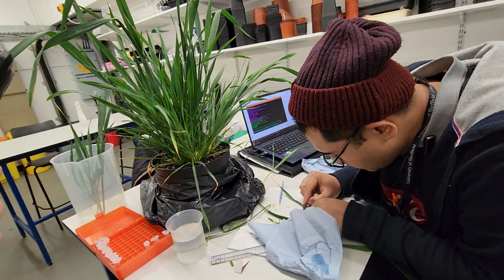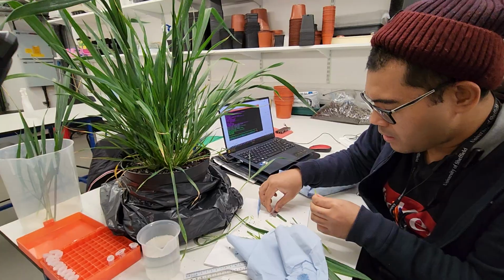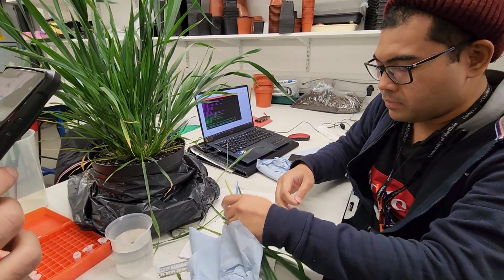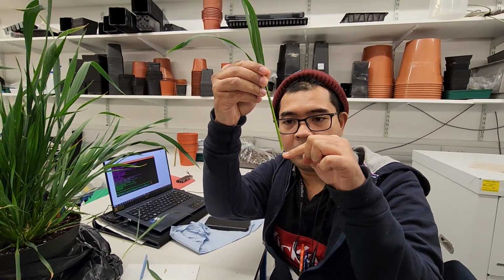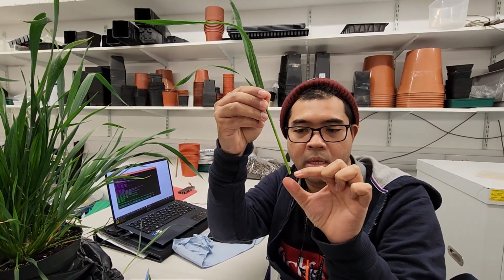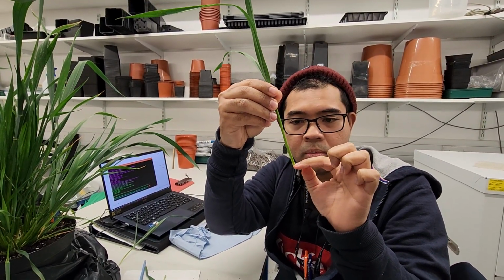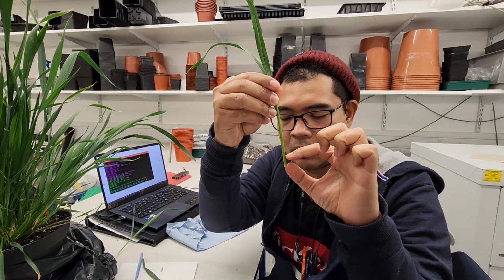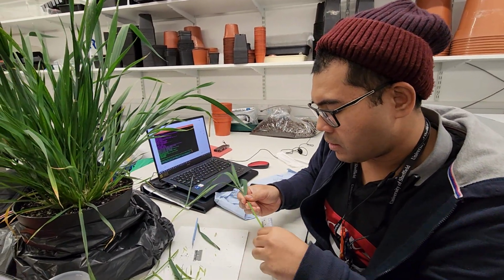So I'll remove this because there's nothing in there. Right, so this is the portion. I've removed the lower bit, the elongated bit. So this is actually the beginning of the bump, or the node. So the meristem should be somewhere in here. That's why we need to cut about 1 centimeter from the base.